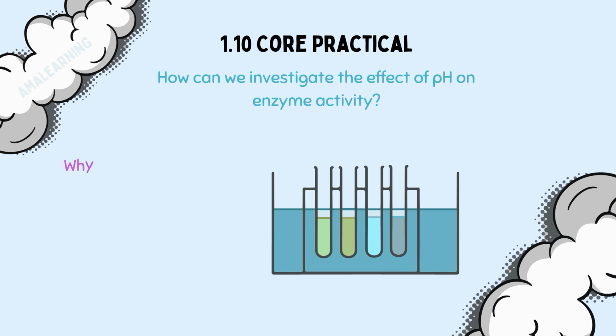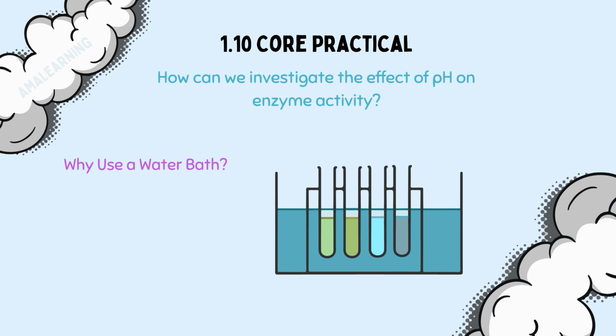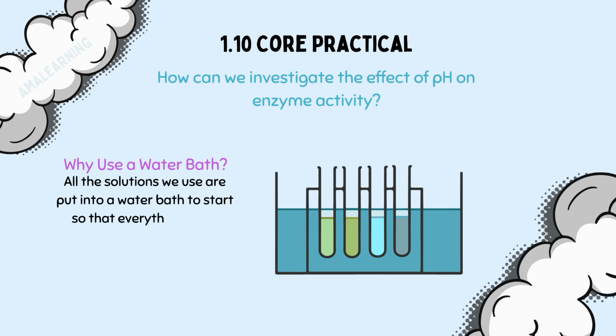It is important to know why a water bath is used. All the solutions we use are put into a water bath before the experiment starts. This ensures that everything has a chance to get to the same temperature.